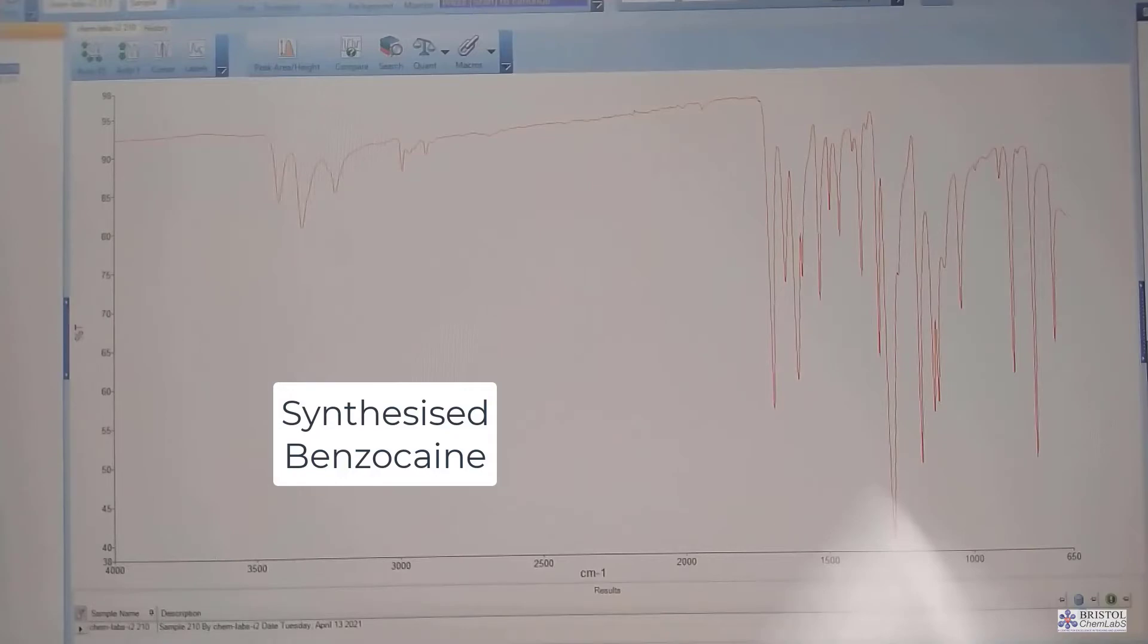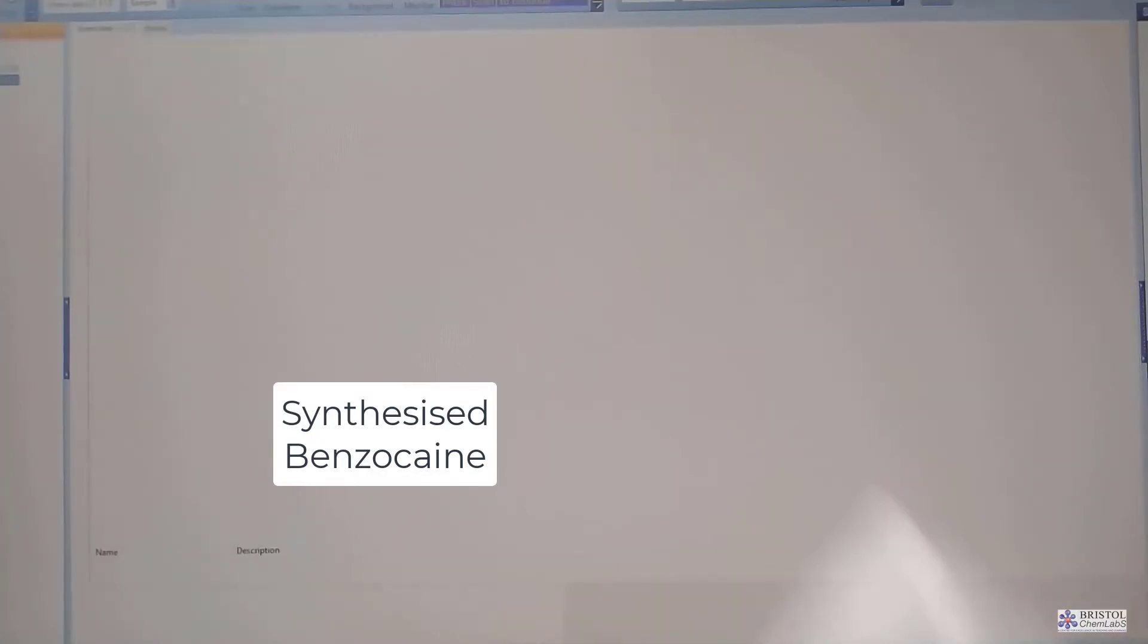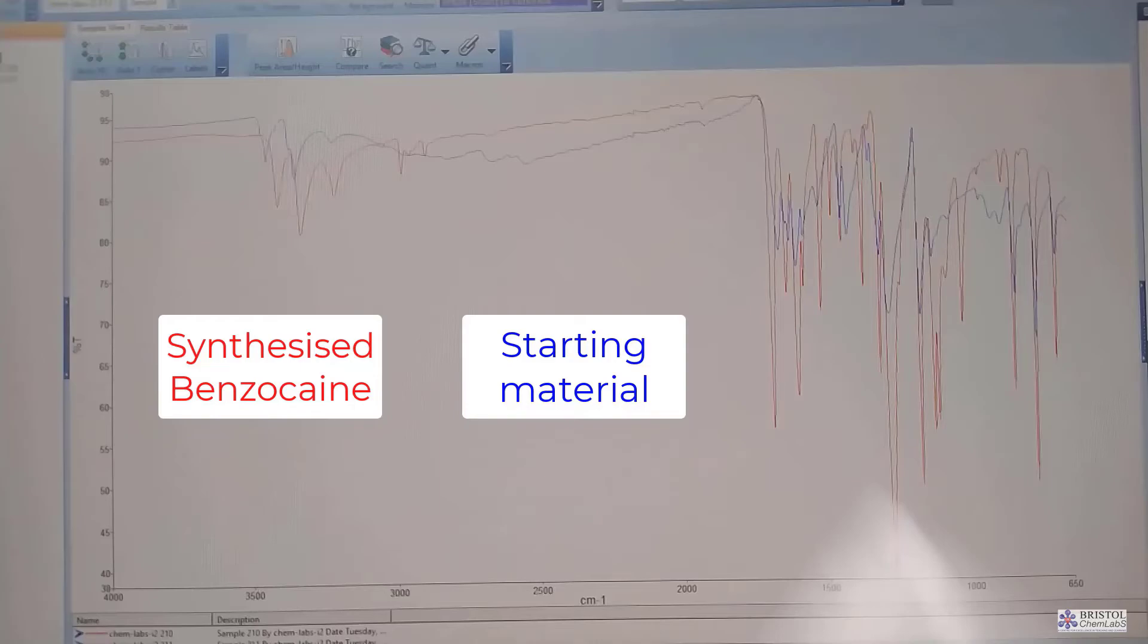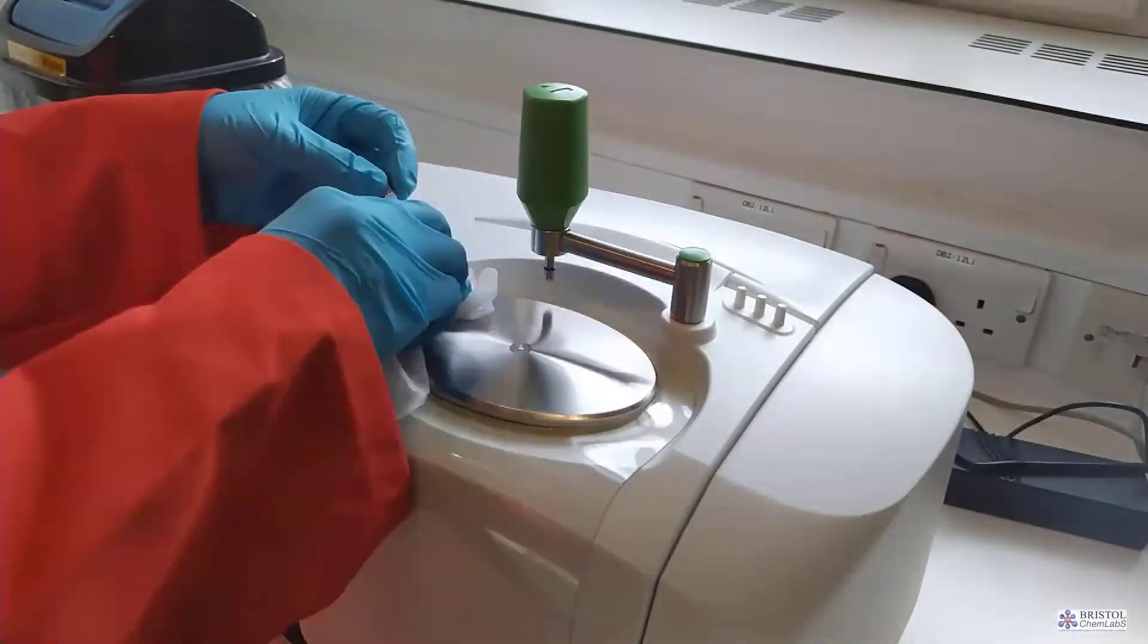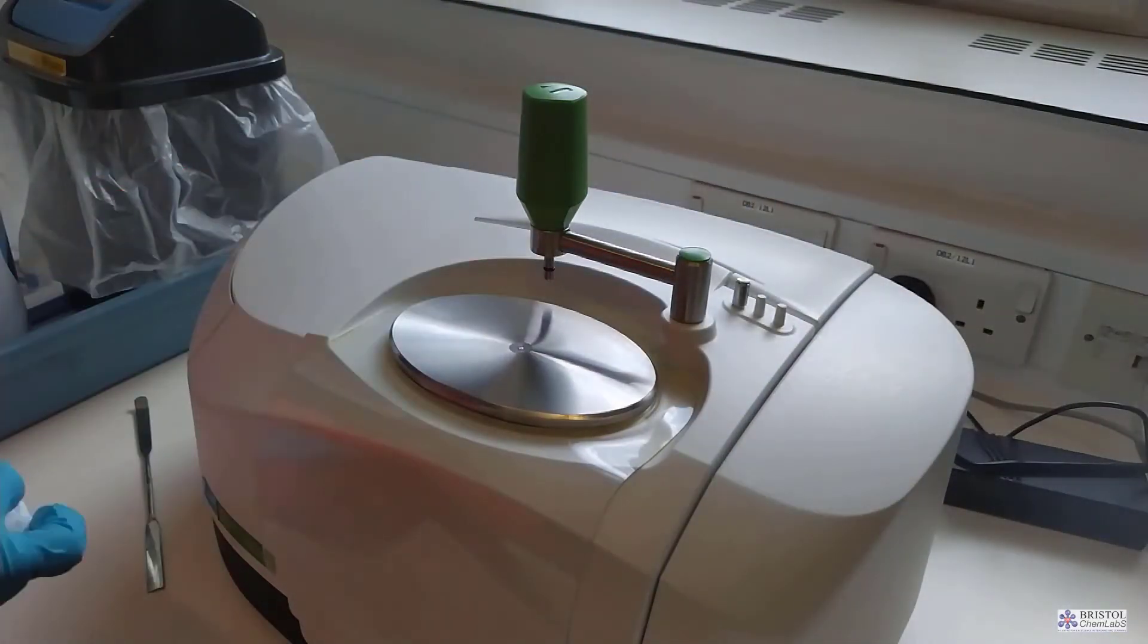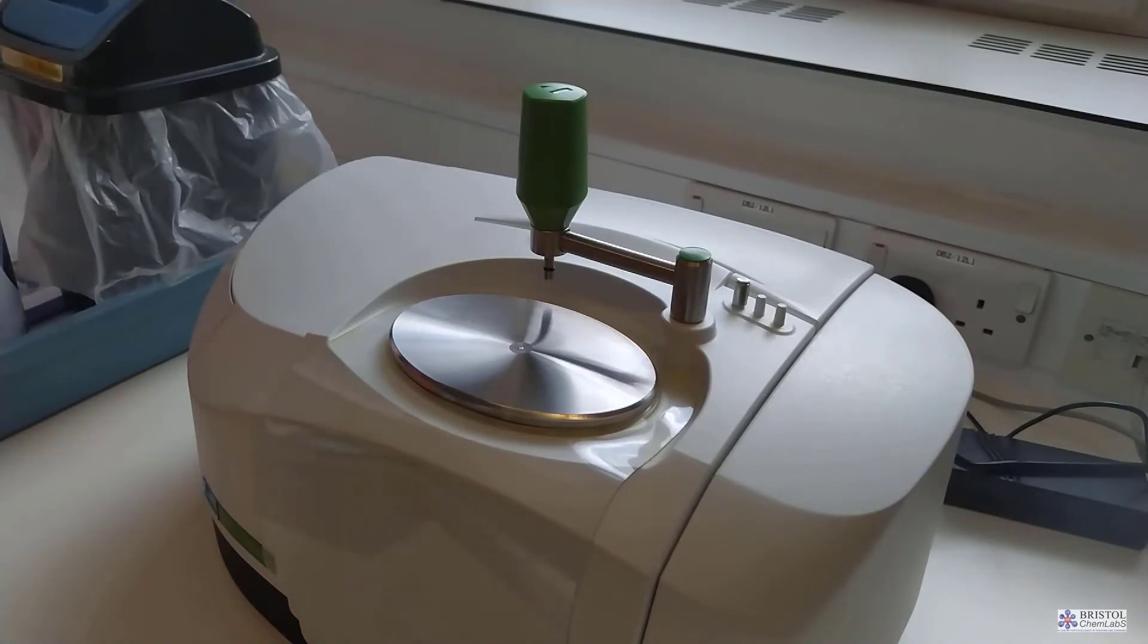We can use the infrared spectrometer to run both the sample of product and the starting material, so that comparisons can be made between the two spectra. The spectra can be printed off or saved to a memory stick or to the student's file space. Always clean up the spectrometer after use. It's only a poor chemist that leaves chemicals unlabeled in a laboratory even if it's a small sample.